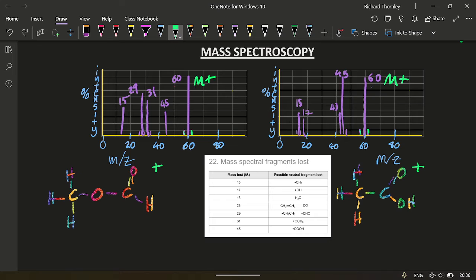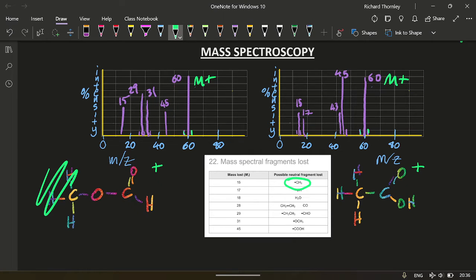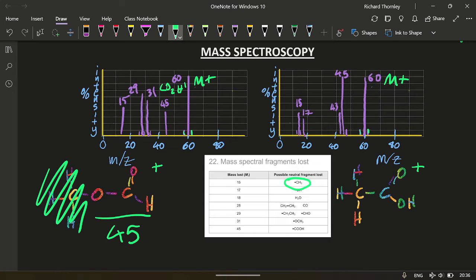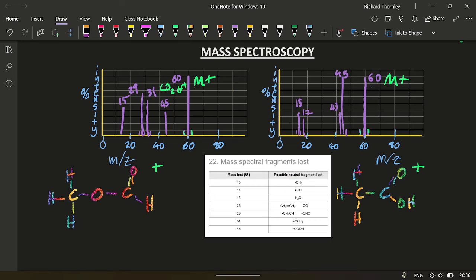OK, so I've got something that weighs 45. So it must have lost 15. So what's lost 15? 15 is this. So this is gone and this is left as being 45. 45. So that's my CO2H plus. All right. What's next?